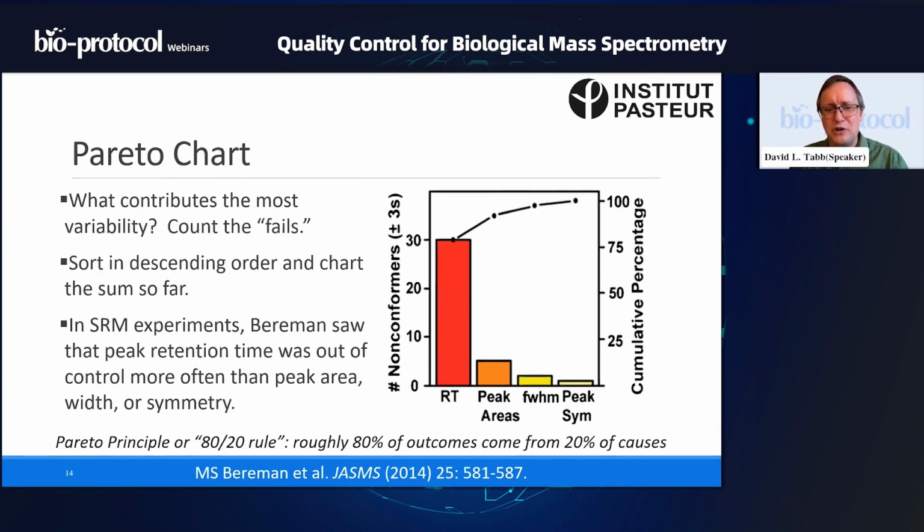Now I have to say Pareto charts are one of my favorite diagrams. And I think most of it comes from what we often call the 80-20 rule, which is to say that 80% of the time, 20% of your causes lead to the mistake. That is to say that some types of faults are far more common than others.